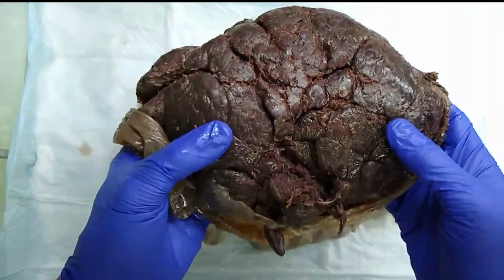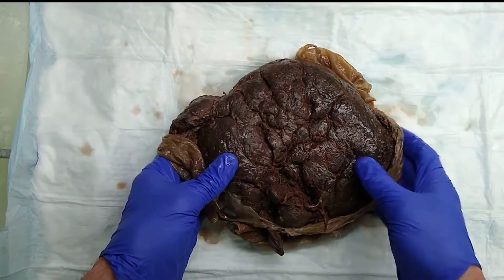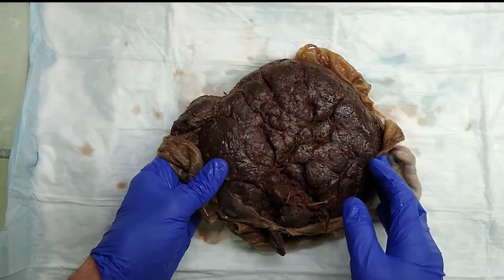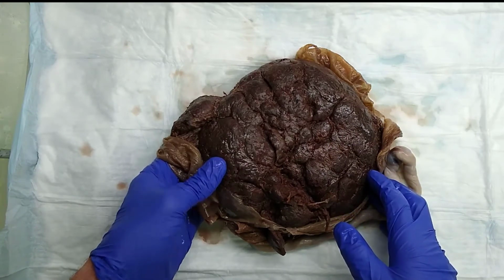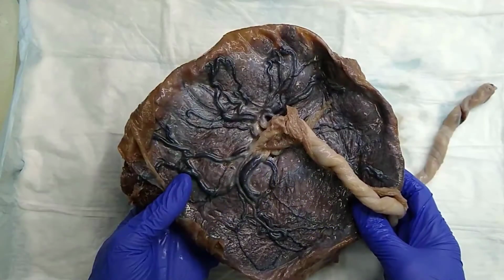Please note that when we are processing these placentas, we actually cut into the placenta, so we do like a bread loaf sectioning, and in that way we can see specific lesions that may be within the parenchyma. So that's the end of this session. Next we will look at some abnormal placentas.